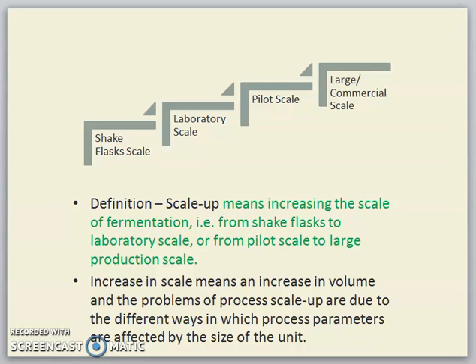Next is the pilot scale, in which we increase the volume from the lab scale into a larger volume, which is known as the pilot scale. And if we succeed in the pilot scale, then we shall go to the larger scale for commercialization.